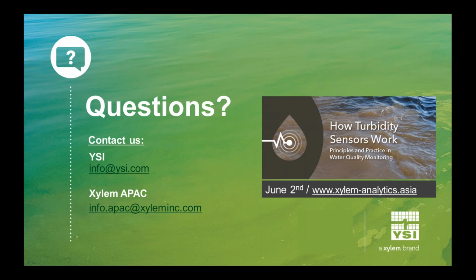You can do it for phycocyanin as well. But generally speaking, I don't recommend it because you have to be a pretty good laboratorian to pull it off. Now, if you are, you can try that. There's nothing preventing you from trying that, and you can put in your own parts per billion units during that calibration. But really, rhodamine is tried and true. It's easy, it's cheap, it's the best way to go.